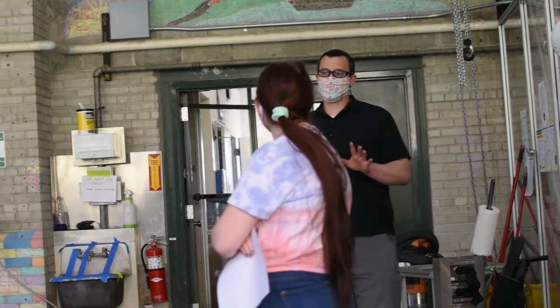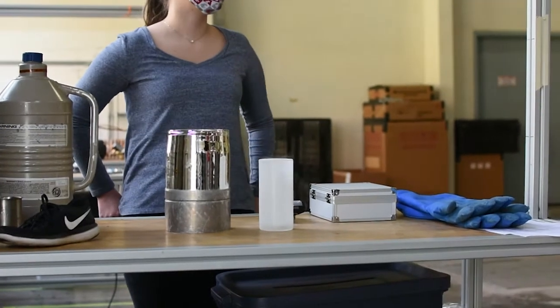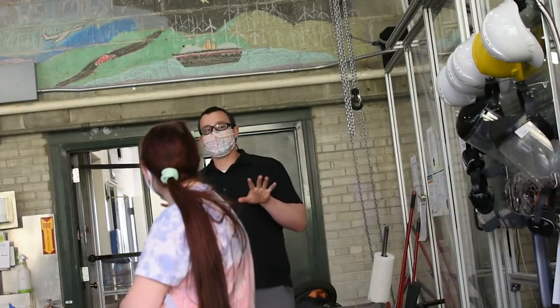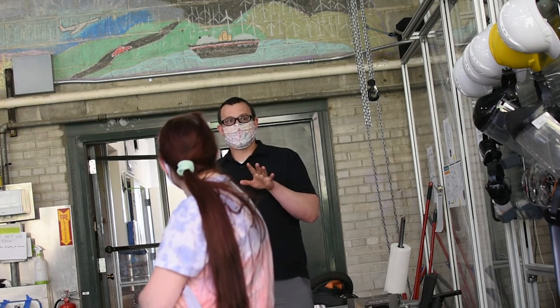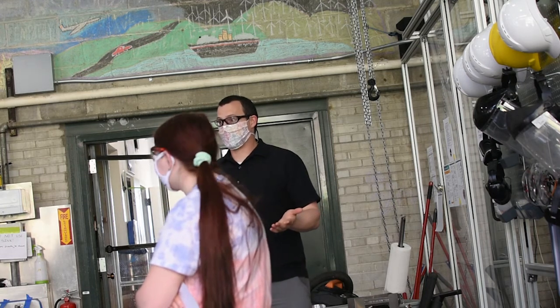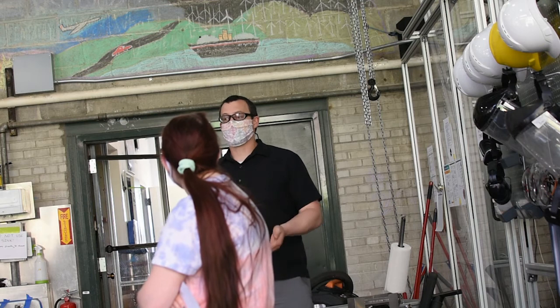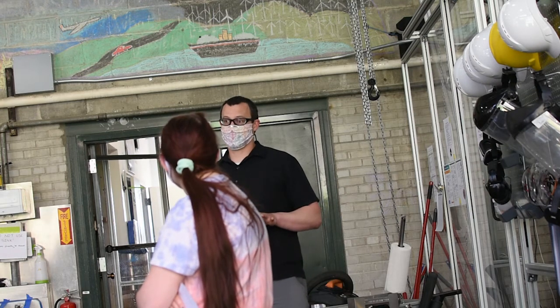Now the issue, why this is a serious concern, is can you tell that that's nitrogen in there, Lauren? No. It's a colorless, odorless, tasteless gas, right? You have no idea you're breathing out all of your oxygen and breathing in a full load of nitrogen. It's not like going underwater where you can't breathe, because there, you've held your breath. In this instance, you don't even realize you're running out of air. You just go face down. You'll just breathe in the full load of nitrogen and just be down. That's why it's so dangerous, and you need to be careful about asphyxiation risks in a situation like that.